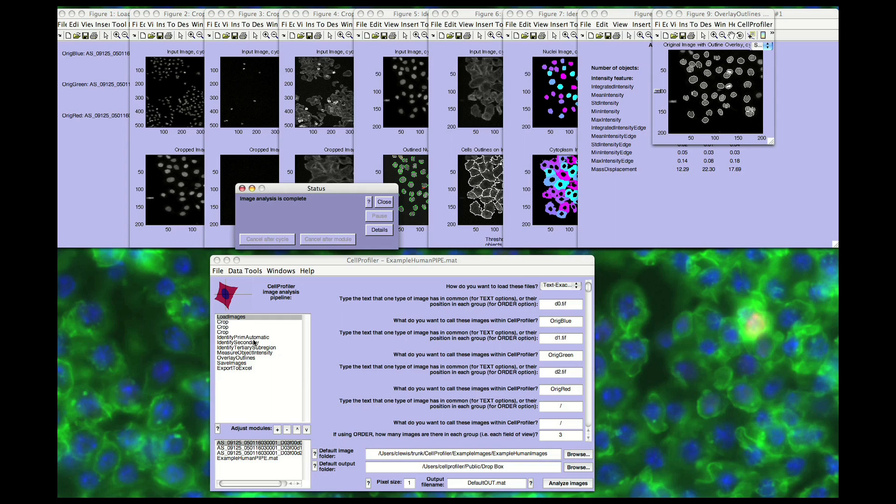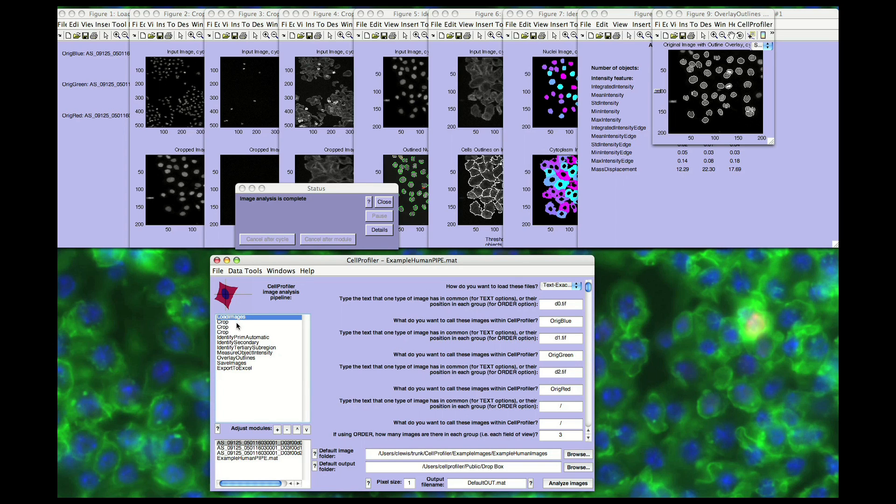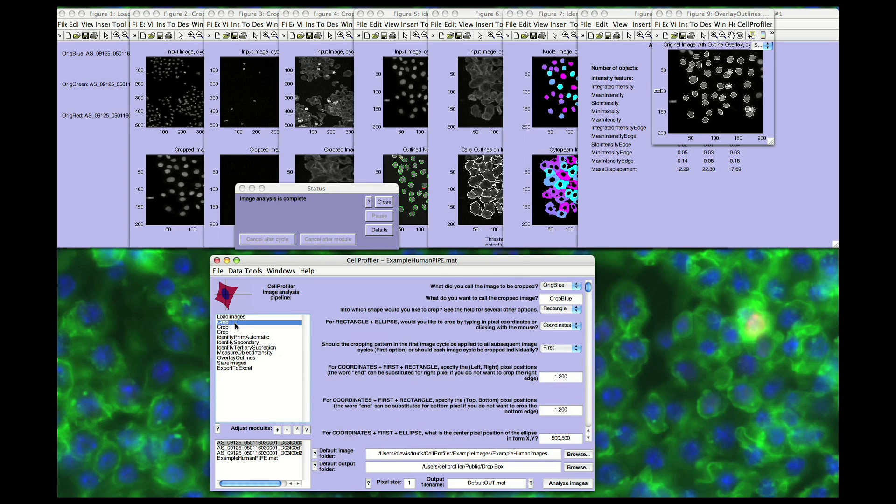Most of the modules are automatic, but the software also allows for interactivity as needed. Modules are mixed and matched for a specific project, and each module's settings are adjusted appropriately. For this demo, after the images are loaded, we have cropped them to better highlight the features of interest.